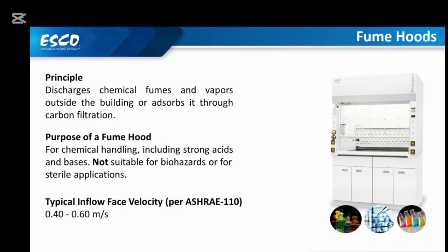So ducted fume hoods do not have filters. They just pull the fumes away from the operator through outside the building. The ductless fume hoods are the ones that come with carbon filters. So the typical inflow face velocity as per ASHRAE 110. ASHRAE is the American certification standard.